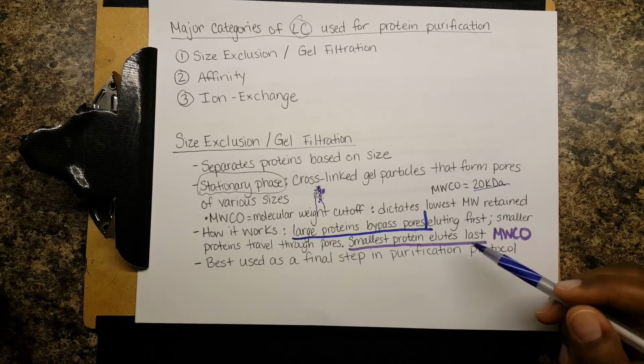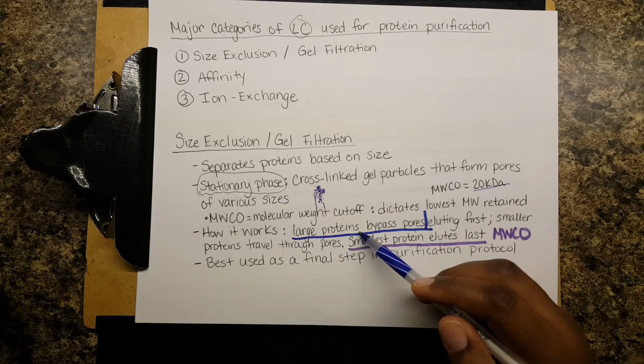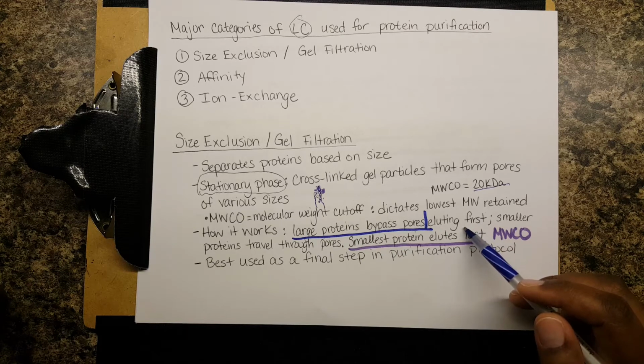The way that it works is that the large proteins bypass the pores. So they're not even bothered. They're like, okay, yeah, I see this. It's a little bit of a jungle, too much of a tight squeeze for me. I'm just going to go around. That means that they elute first.